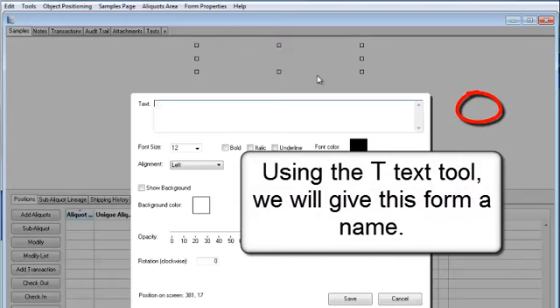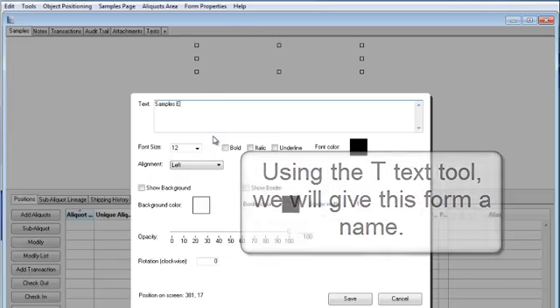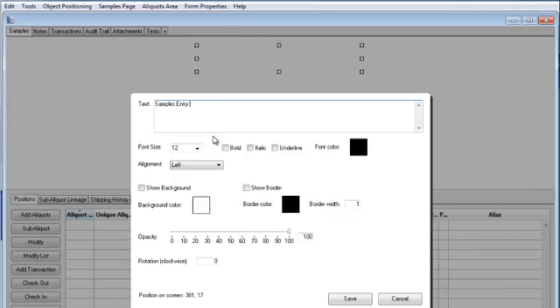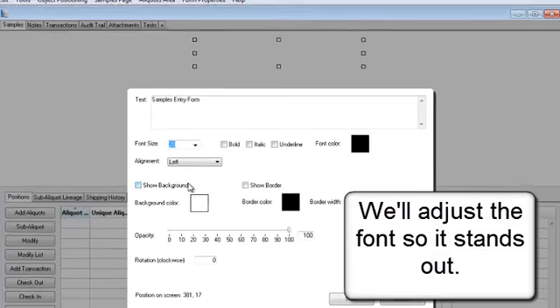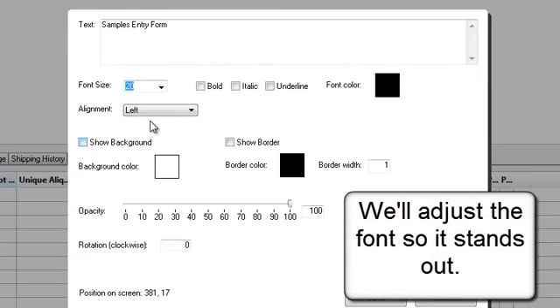Using the text tool, we will give this form a name. We'll adjust the font so it stands out.